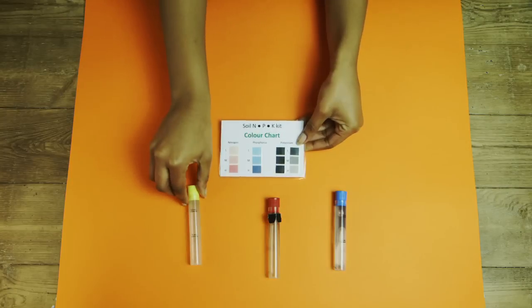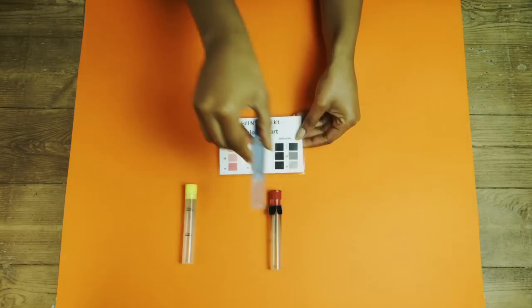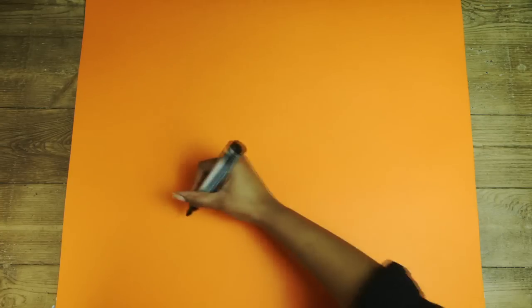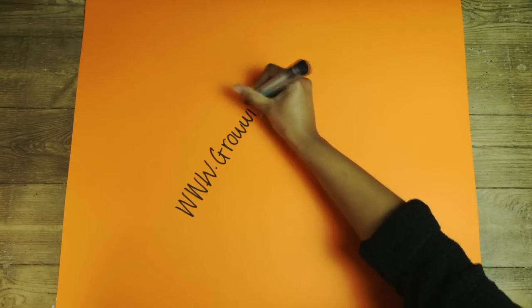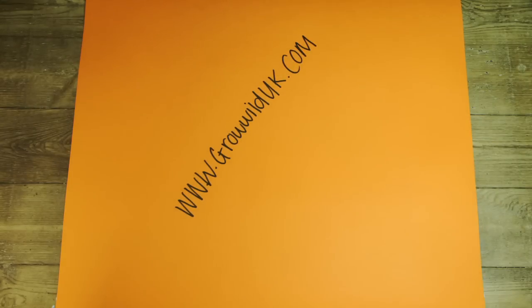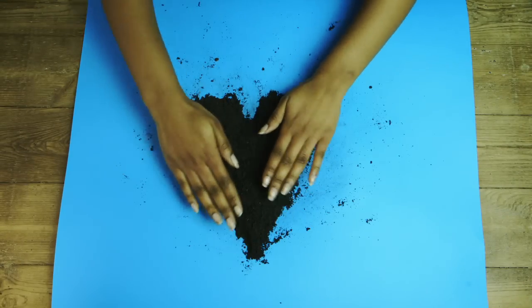While you wait, check out all your hard work by comparing the other test tubes with the colour chart. Check your phosphorus test against the colour chart. What did you get? Does that mean it's high or low? Make a note of your results and when you next go online you can share them on the website www.growwilduk.com. Low to medium levels of potassium, nitrate and phosphorus are perfect.